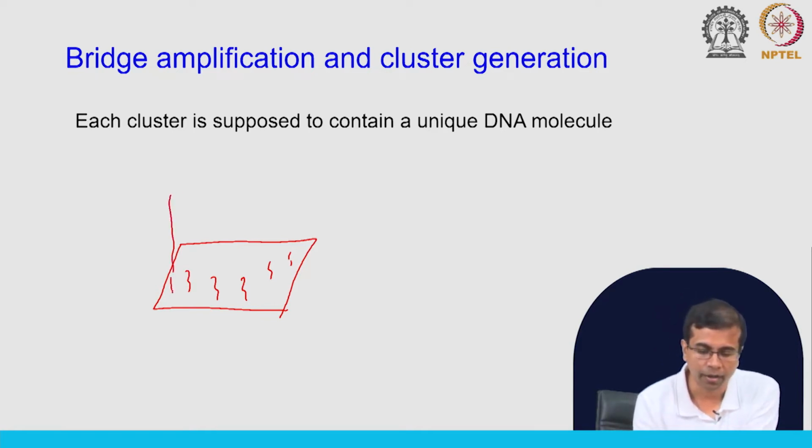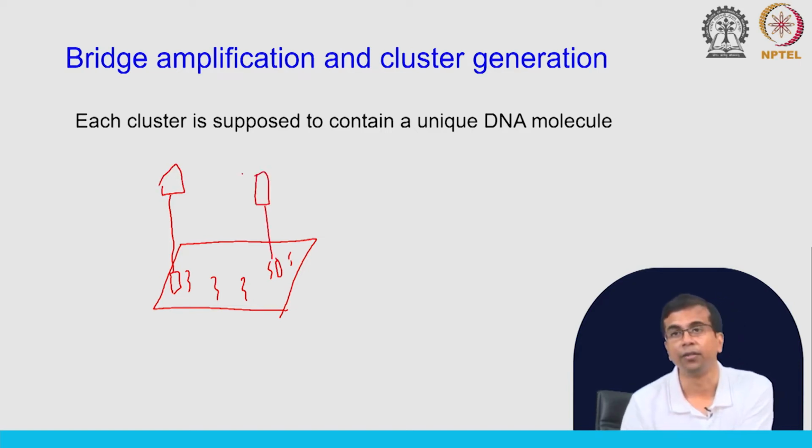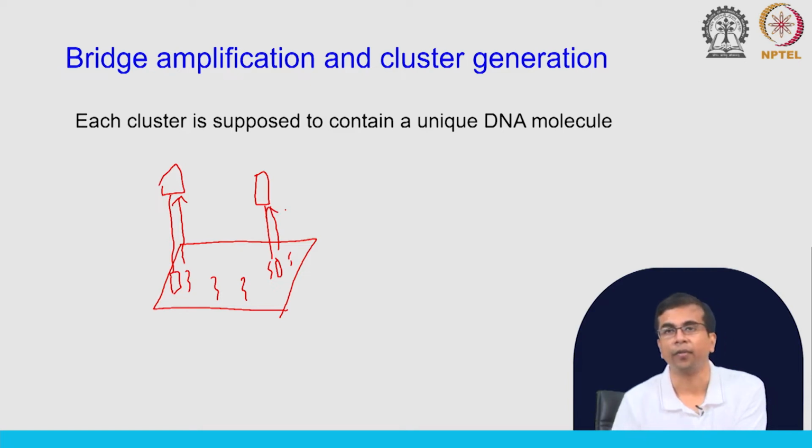This DNA molecule with adapters will come and hybridize. Now, you can amplify these fragments using DNA polymerase.